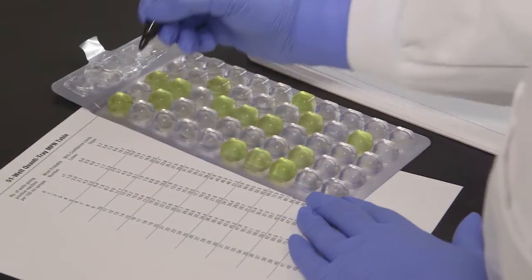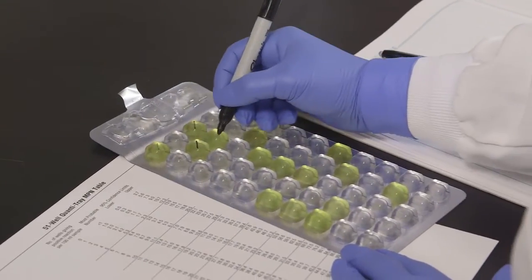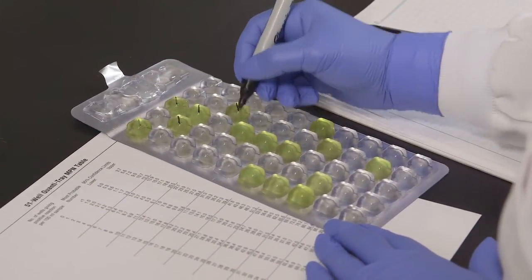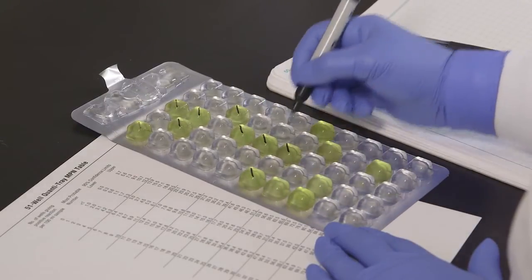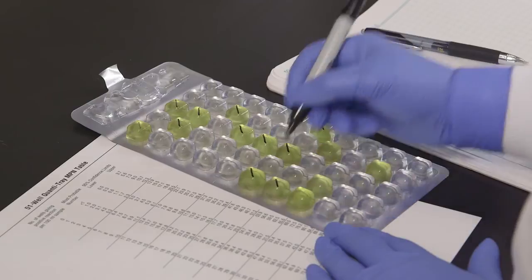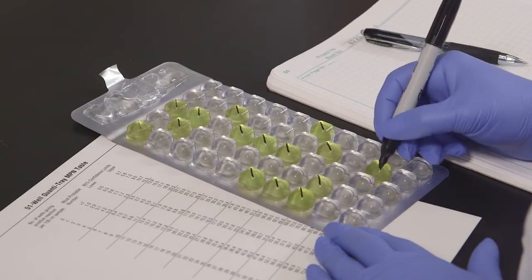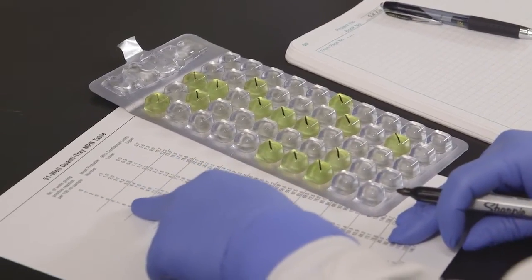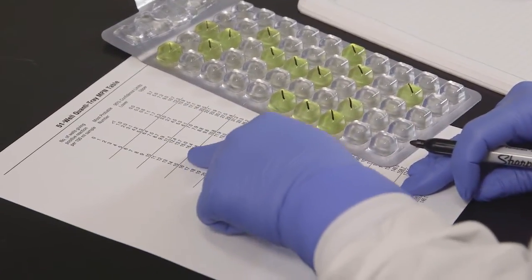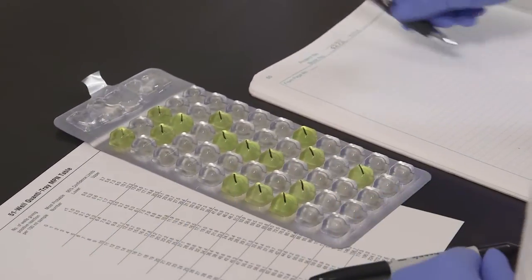After incubation, mark each yellow well with a permanent marker, including the large overflow well. To determine the number of total coliforms, count the yellow wells that are equal to or greater than the comparator, and then refer to the MPN table included with the QuantaTrays. The most probable number of total coliforms for this example is 17.8 per 100 ml. If using QuantaTray 2000, count the overflow well as a large well.